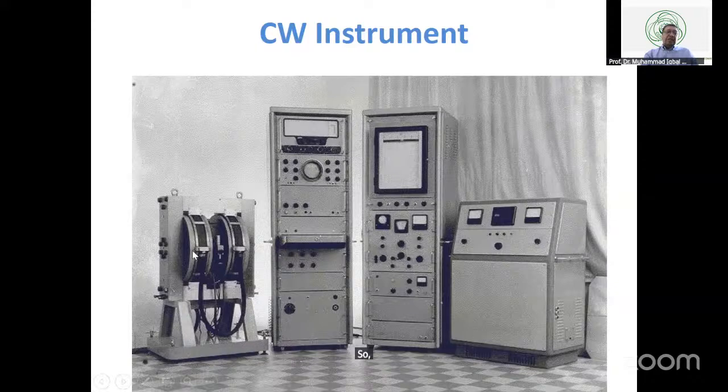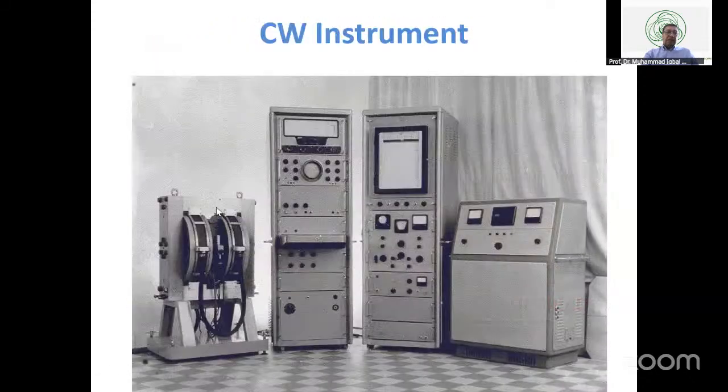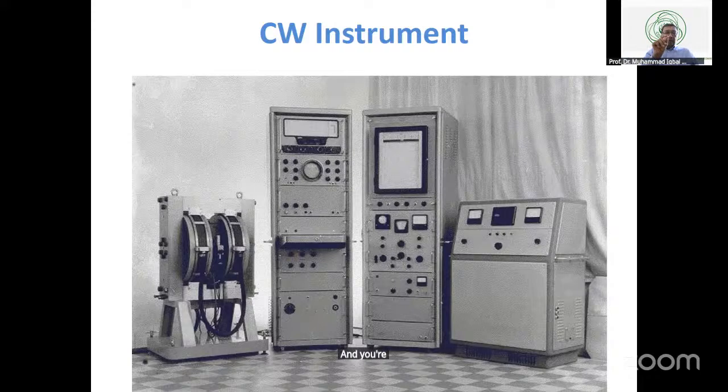So let's say you have a molecule with 10 different types of protons, you stand here, and this is the reason they were developed like standing, because you really need to stand and sweep, slowly sweeping the radio frequency.